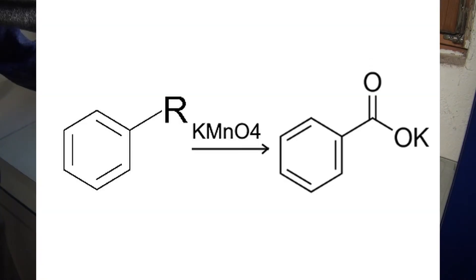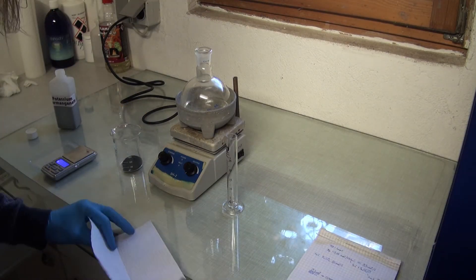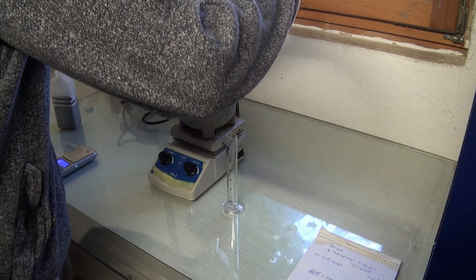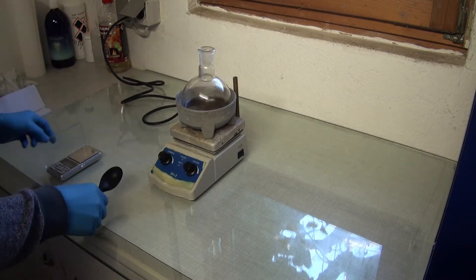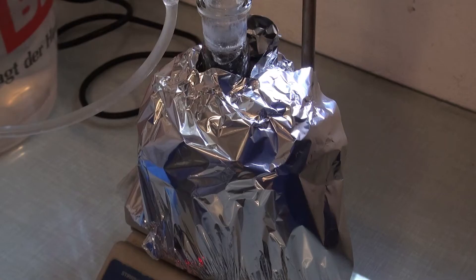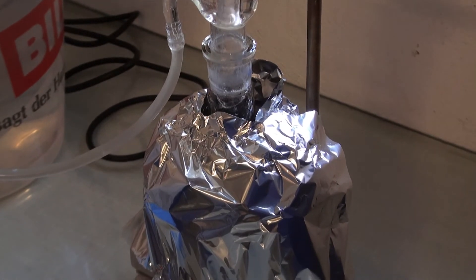Potassium permanganate was used as an oxidizer, but in a big industrial setting, oxygen from air over a vanadium oxide catalyst could be used instead. The aromatic mixture was added into an aqueous potassium permanganate solution and then refluxed for 2 hours.